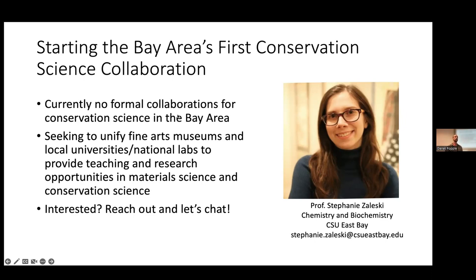In terms of the price tag and the actual analysis, the machines that we're using are probably $1 million machines. They're pretty nice. I just hosted a professor from UCLA who does this work. When he was launching his lab, he made some interesting bets that maybe you don't need the super fast detector, so he optimized his machine and bought things secondhand to drive the price down. But unfortunately it's all TEM, so driving the price down means it's only $500,000, not a million or 10 million. Thank you.